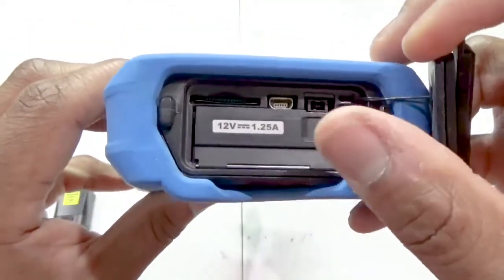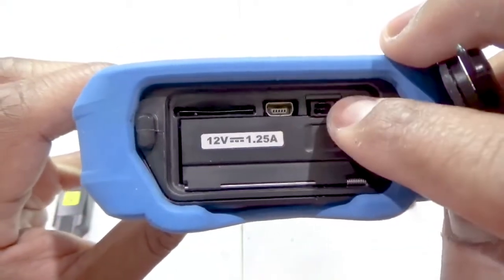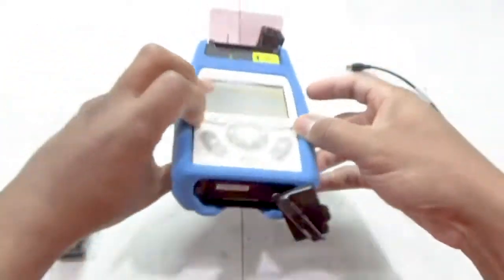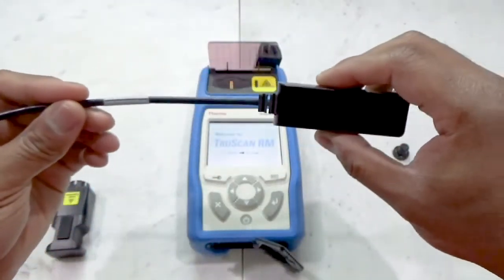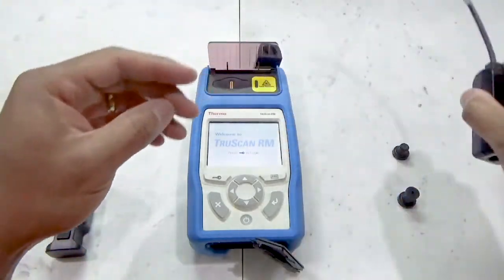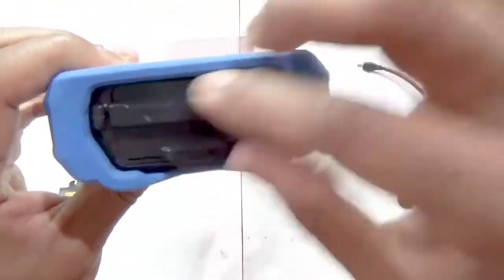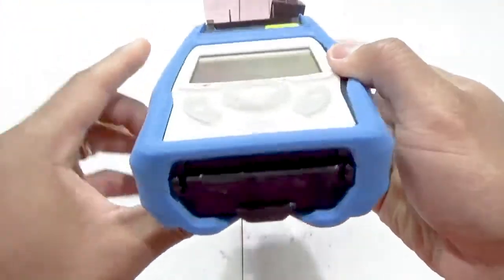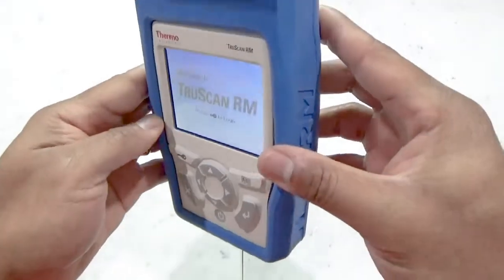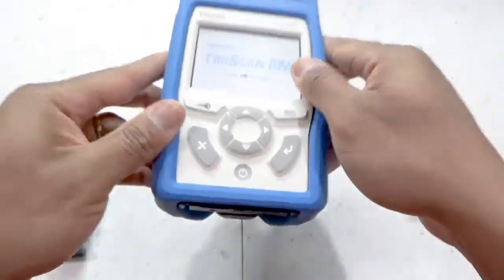On the back of the instrument is the battery and sync access store. With a quick twist, the backing comes off to reveal the battery access store, the data sync port, and the power input port. To securely send data from the instrument to your data archive, the USB ethernet dongle adapter is used with an ethernet cable to access your site's network and archive. When the access door is properly closed, the instrument is both air and water tight and is easily decontaminated. The blue impact boot around the instrument is removable as well.